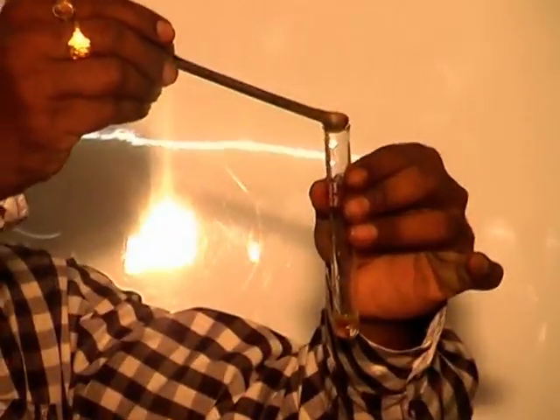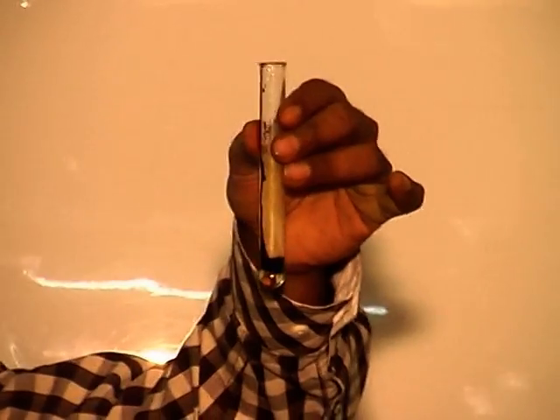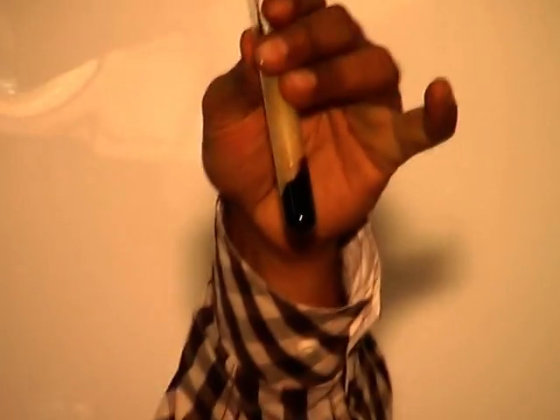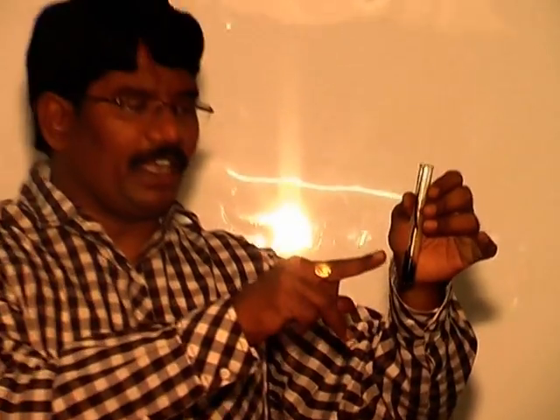Now I am adding the sodium nitrite crystals to this phenol. Now initially we get a dark blue colored solution. At the bottom you will find this dark blue colored solution, and if we add a large quantity of water to this, then it turns to red color. So this is Liebermann's test, and phenol is confirmed.